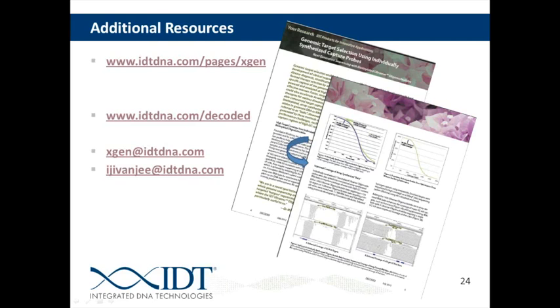It's something we're working on internally, but our feeling is this technology and next-gen sequencing in general is such a developing field at this point that trying to develop software that's going to work well with this is just something that we're not comfortable releasing at this point. We do have a very large and very dedicated team of in-house bioinformaticians that can assist in any custom designs that are needed.